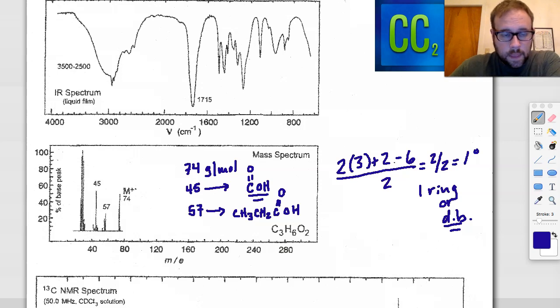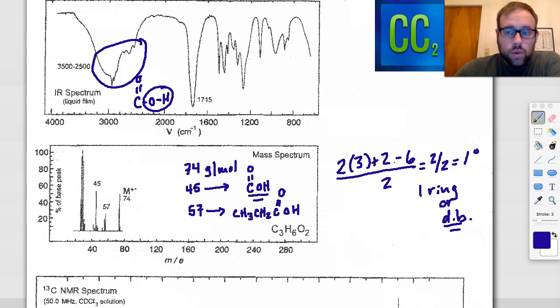If we take a look at the IR, we have two major peaks. The first one ranges from 3500 to 2500, it's broad but it's also got some jagged portions to it. This, if you look at your IR tables, is very distinct of the OH vibration in a carboxylic acid. When you have just an alcohol functionality you get the broadness but you don't get the stretch over that region and the jagged portions. When you get the carboxylic acid portion, you really see more of this sort of half smooth but half jagged formula and it goes over almost a thousand wave numbers, which is exactly what we see here.